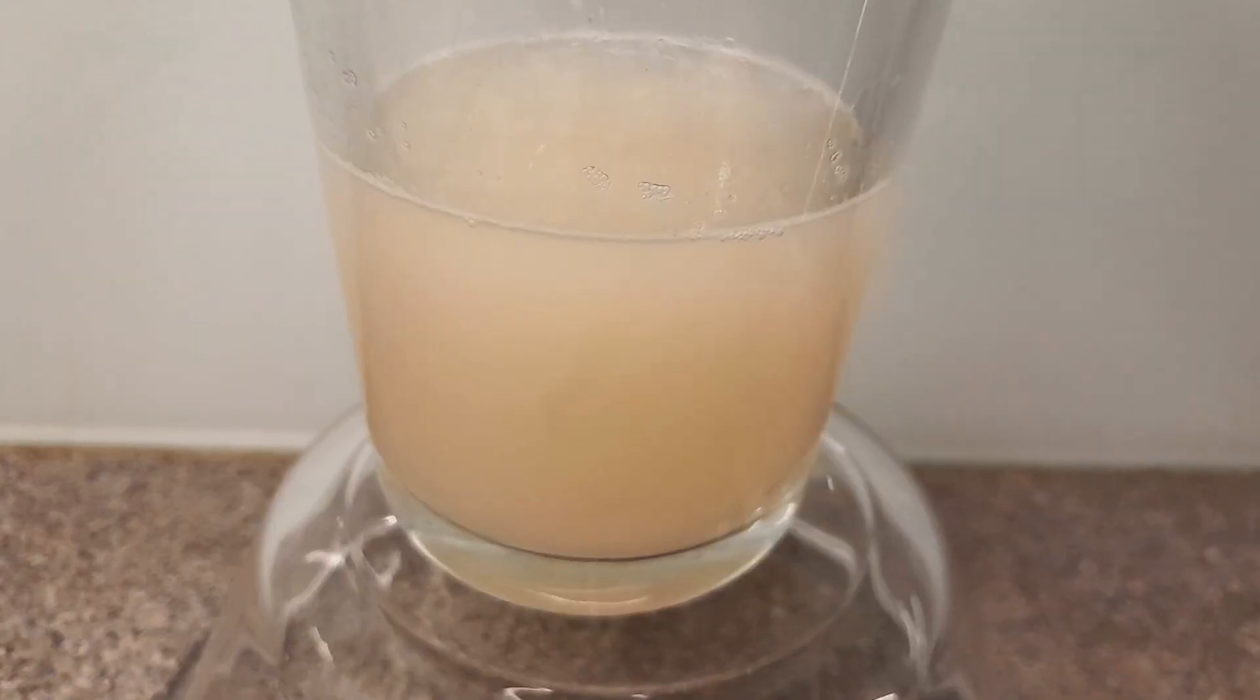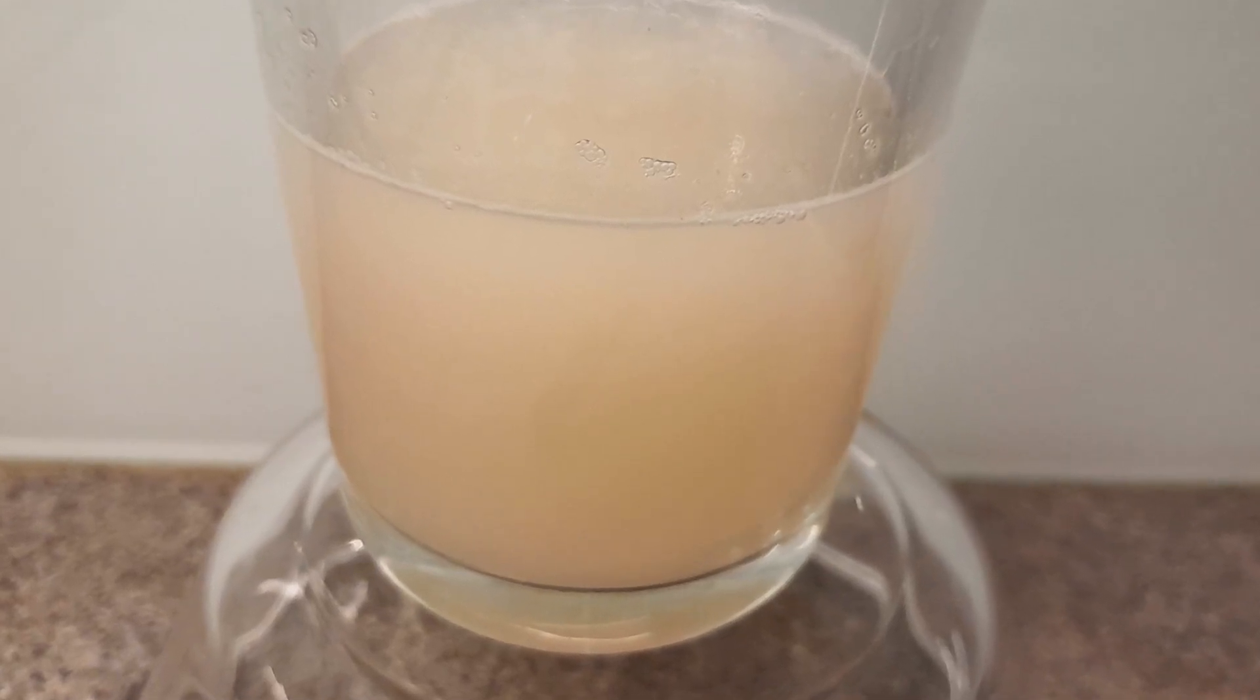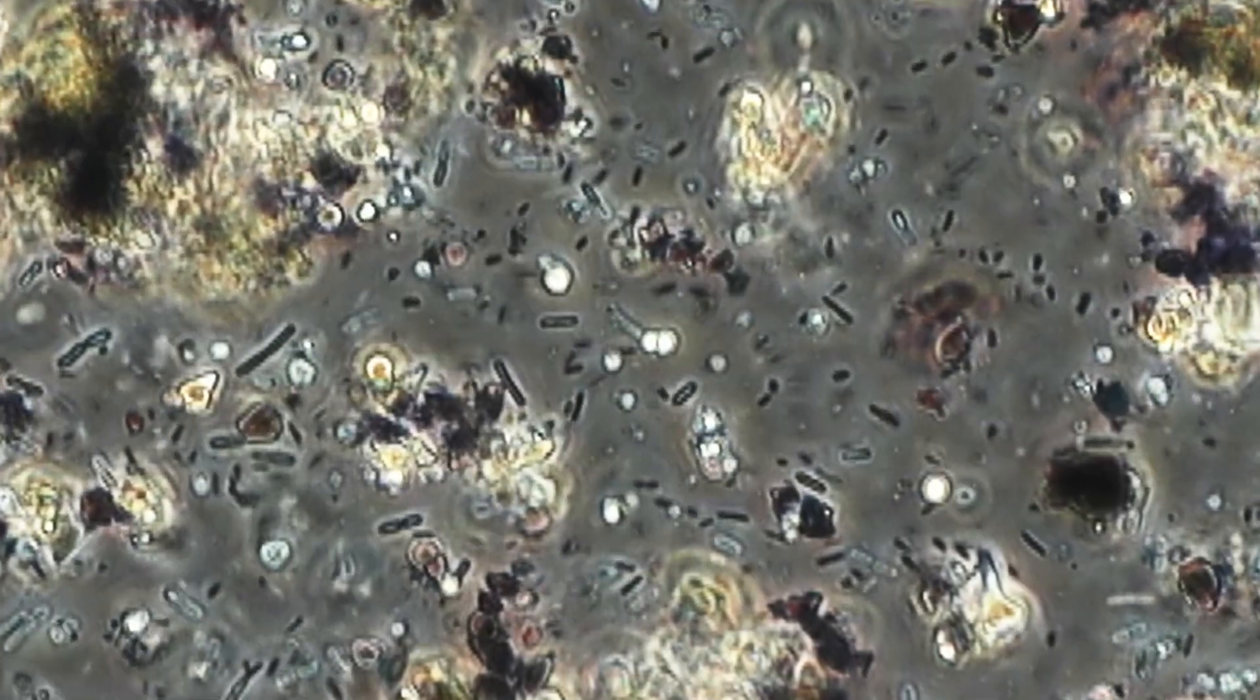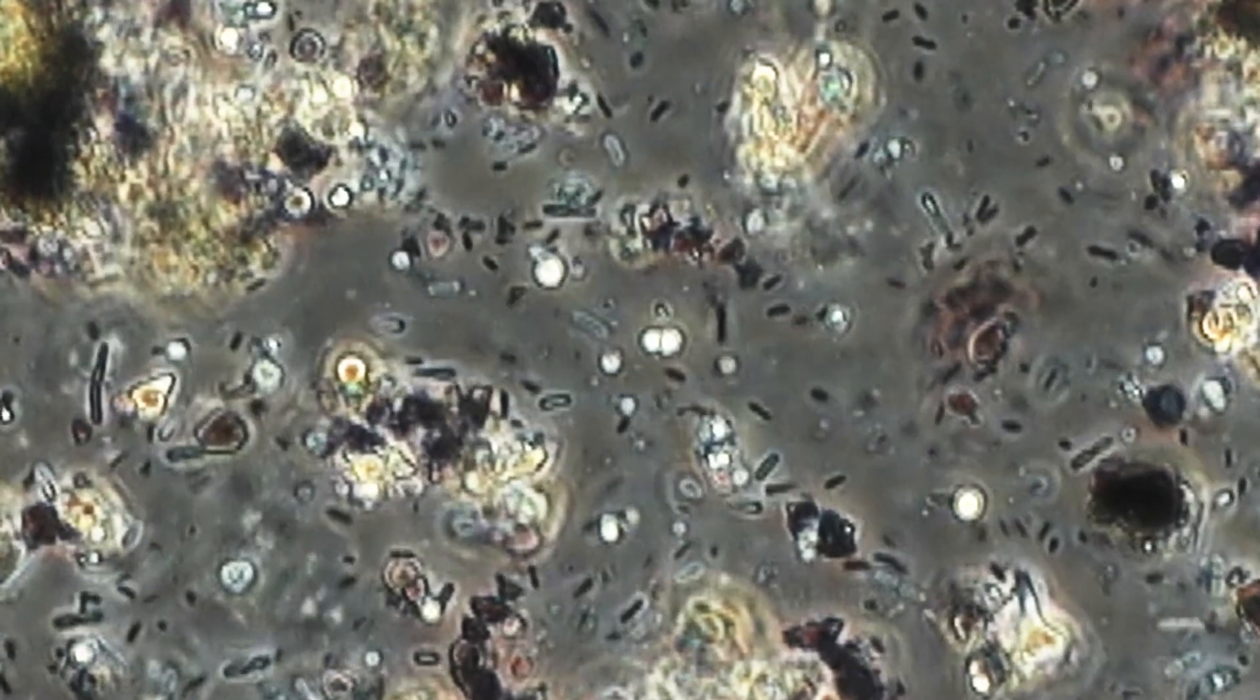But maybe you've already guessed why there are so many bacteria. It was because, as I mentioned a few minutes ago, I left the starch water out at room temperature for approximately two days for the starch to settle. And this is actually the problem because during this time bacteria started to reproduce in the liquid. That's basically what I was seeing here because contaminants from the air fell into the starchy water, plenty of food present, plenty of nutrients, and they immediately started to reproduce exponentially. That's why there were so many bacteria present after two days.